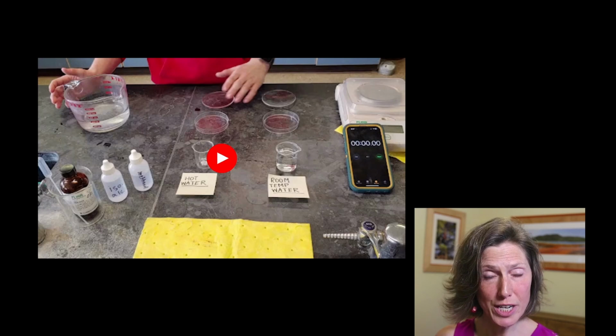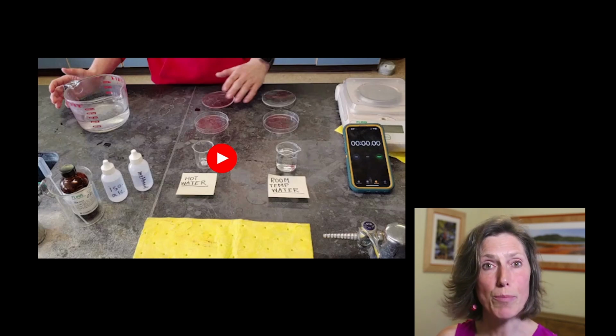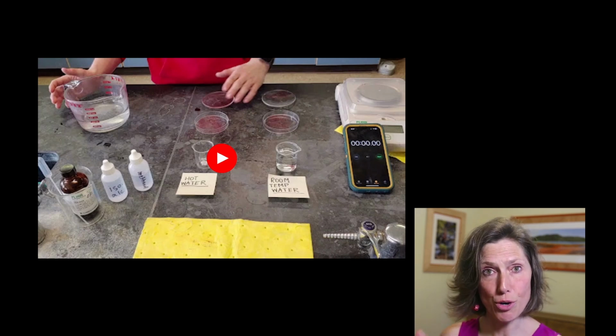So in this video, I would like to share with you the lab that I do with my students to either review or help them understand intermolecular forces. I call it the Volatility Lab. Before I'm ready to show you the demonstration that my student gives here in this video, let me take you to the handouts, the keys that I have, and also sample student data.